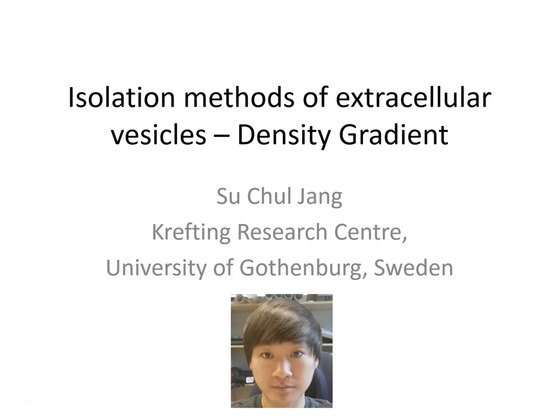The topic of this presentation is isolation method of extracellular vesicles focused on density gradient. It will start with a basic background of density gradient and will continue how this method is applied to EV isolation.